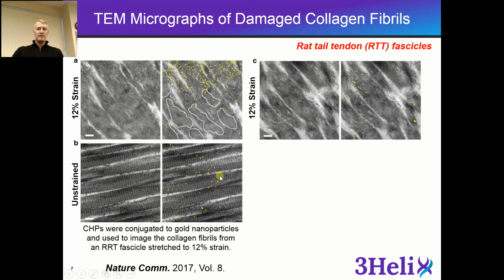So between the 3 of these, you can see that there is a low level of nonspecific binding with the collagen hybridizing peptide, and that it only binds to regions where there's high collagen damage. So these banded patterns are still intact.